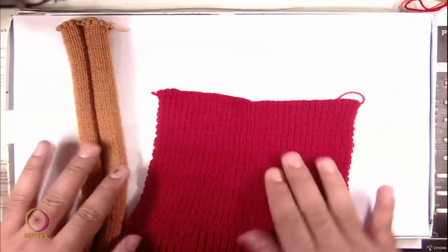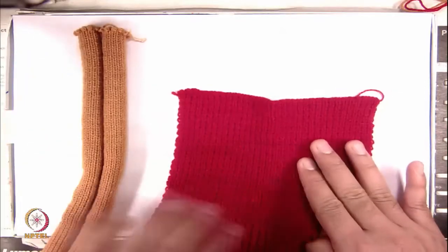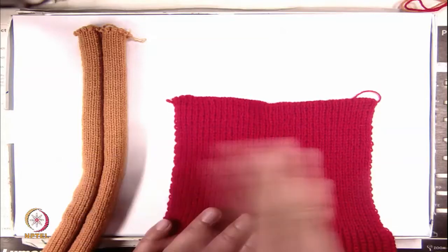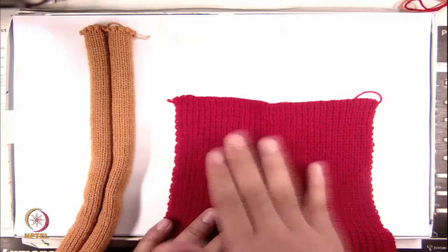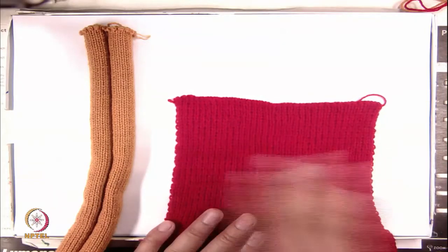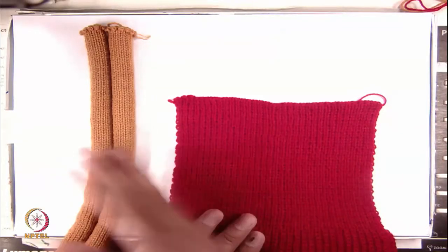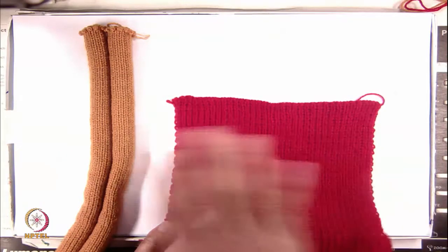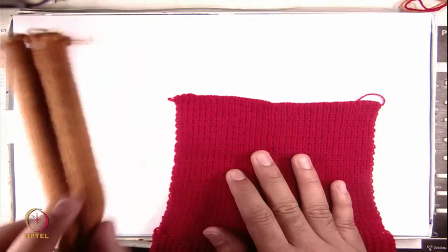One is single jersey. This one on my left side is the single jersey structure, and the other one is the double jersey structure. You can clearly see the structures have different natures. One is curling from the edges, and this structure looks much more stable. In coming weeks, I will explain why these structures have different natures, why one is curling and why one is more stable. But for the time being, just assume that this curling structure is single jersey.